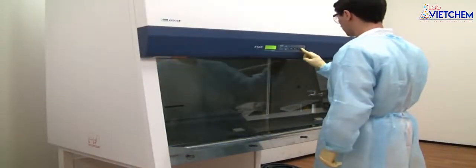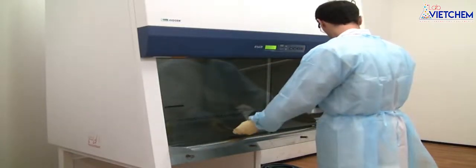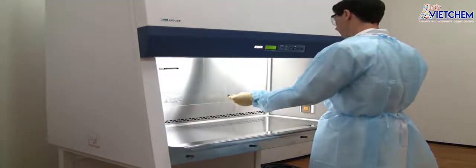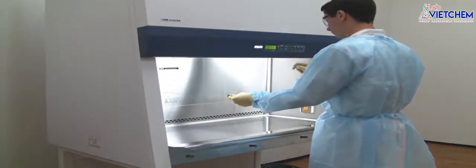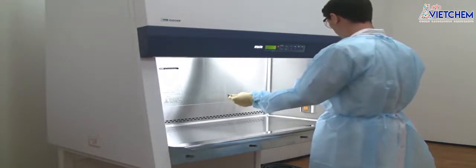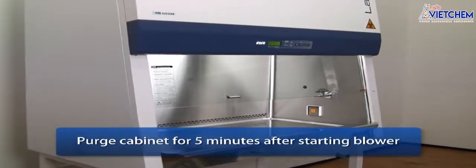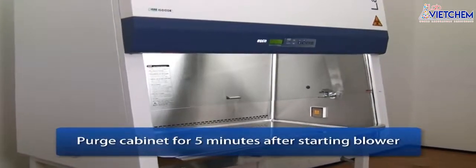If a germicidal UV lamp is being used, you must deactivate the lamp as soon as you enter the laboratory. Raise the front sliding sash to the opening height and turn on the fluorescent lights. Ensure the air intake and exhaust area of the cabinet are free of obstruction. Start the cabinet blower and allow the cabinet to purge for 3 to 5 minutes. This will remove the airborne contaminants from the work zone and stabilize the cabinet airflow.